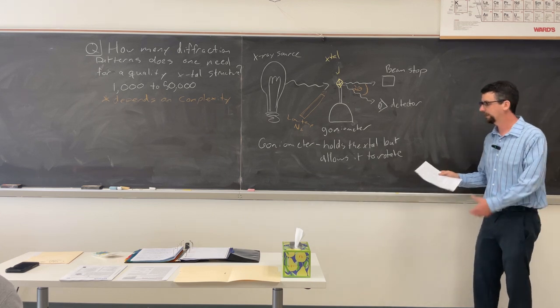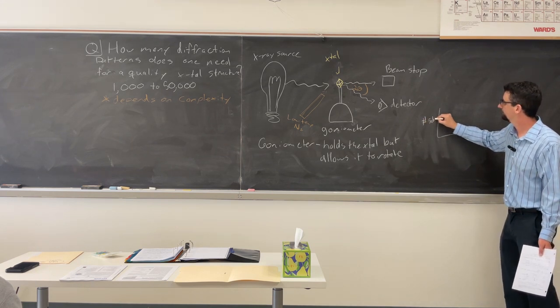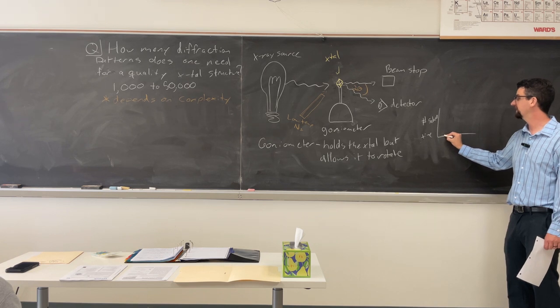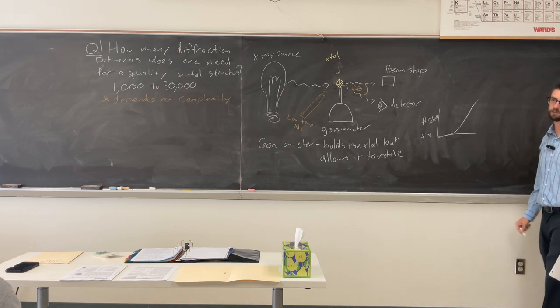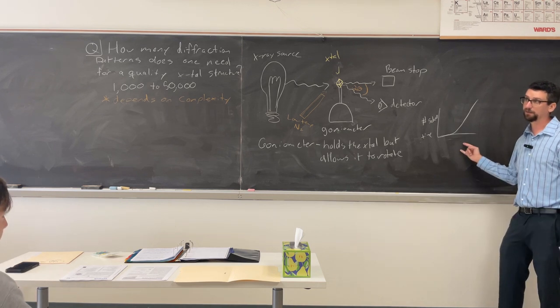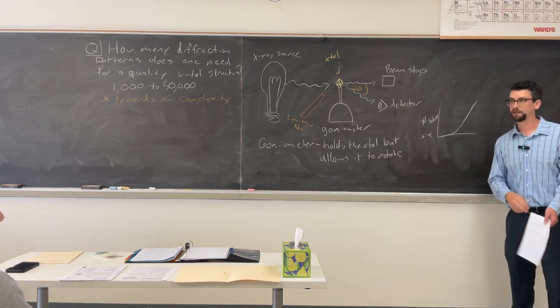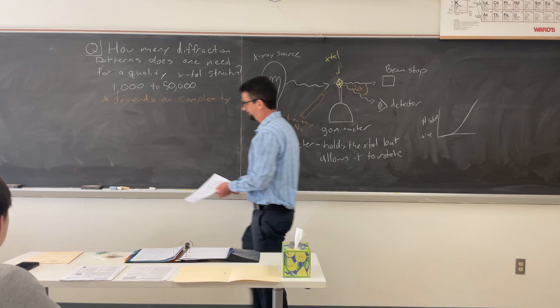But that's also why, if you look at the number of solved crystal structures over time, in 1920, it was like nothing, maybe a handful of them. And all of a sudden, it's going exponential. Big advent with different detectors, electronics, and computers. This is getting faster. Back in the 70s, you used to be given a PhD to solve a crystal structure. Now you can do it on a bench top with an instrument that is way smaller. It's crazy. Okay, so the next question.